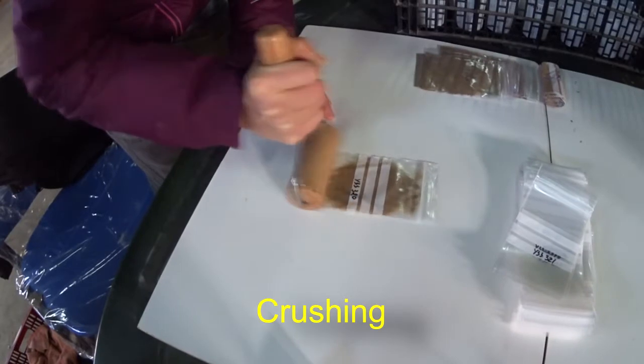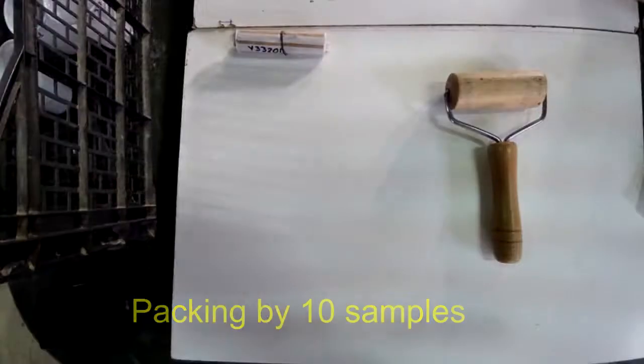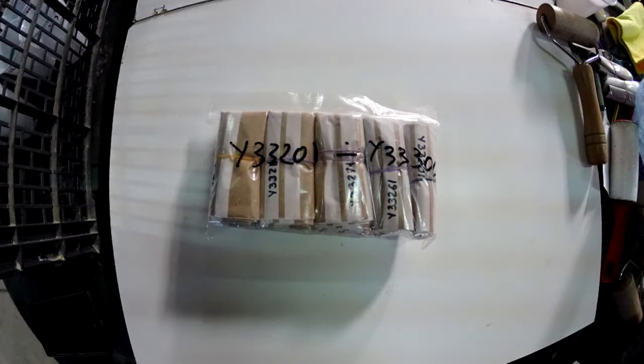Weight of 100 samples ready for assays is only 800 grams. Thousands of samples could be sent to the laboratory from anywhere in the world, quickly and at low cost.